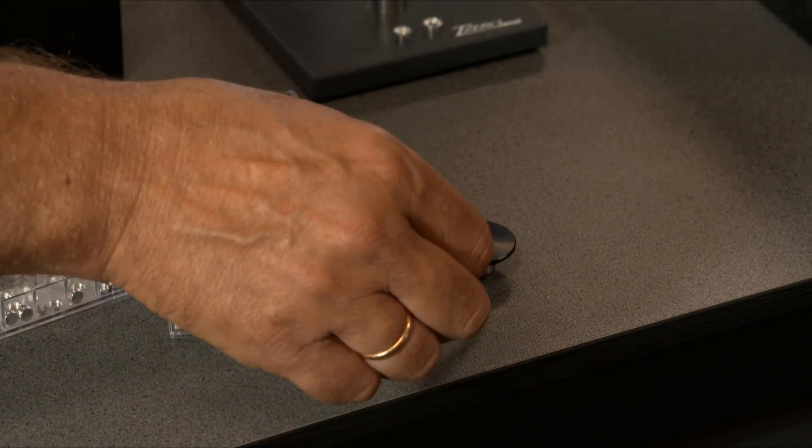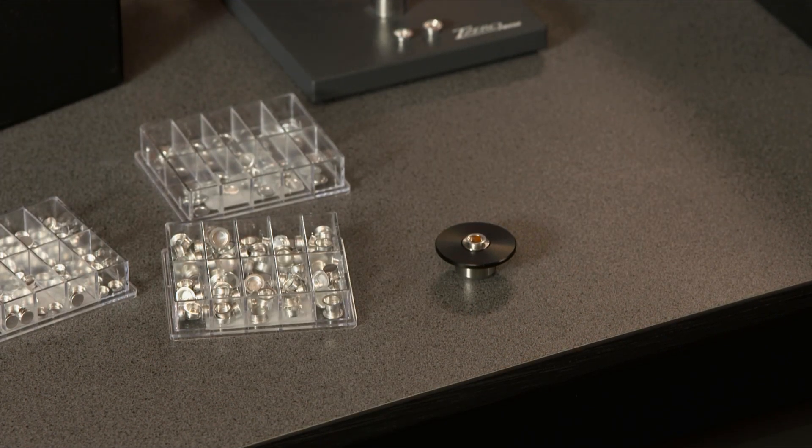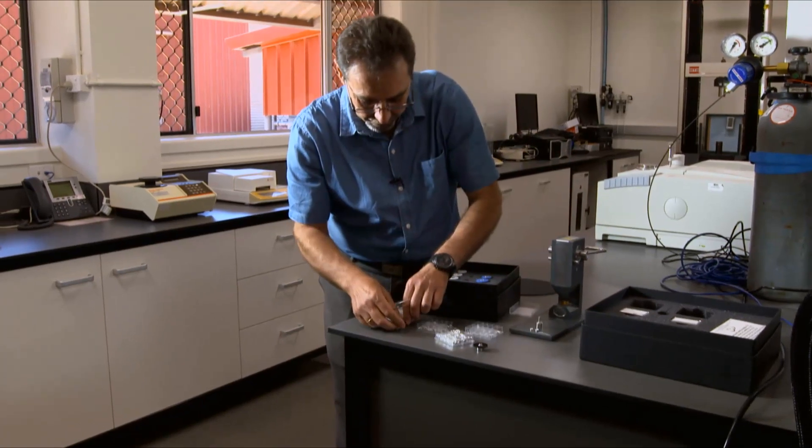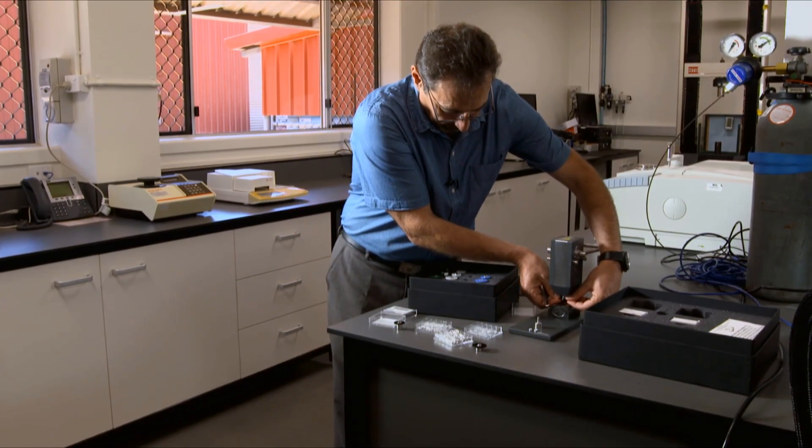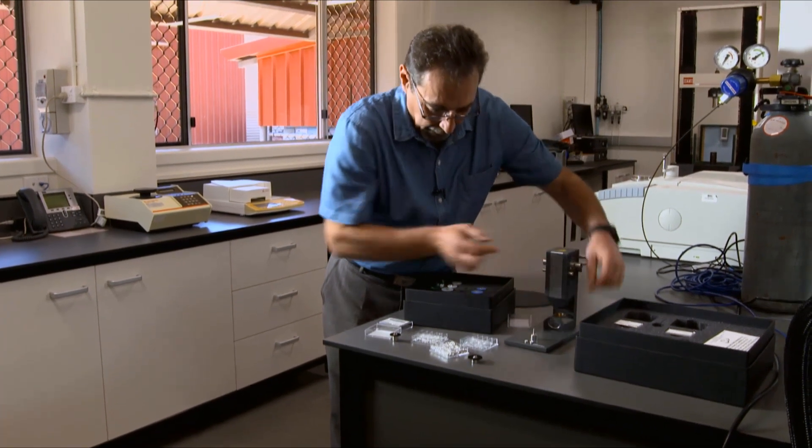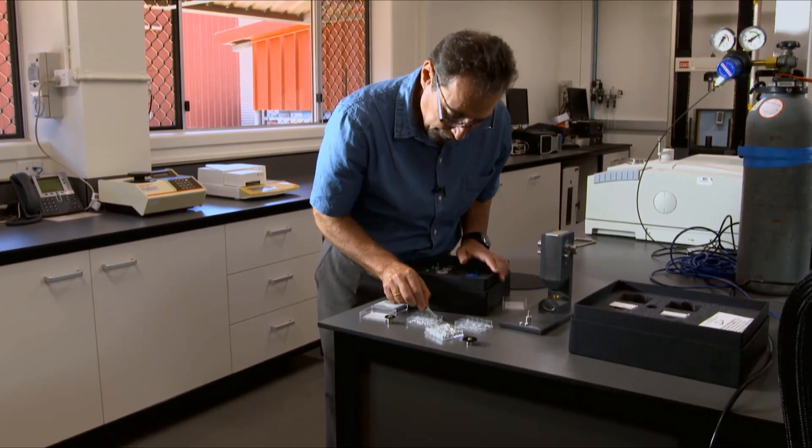And then you can crimp it. In this case, we are going to use another type of die. Put lid on.